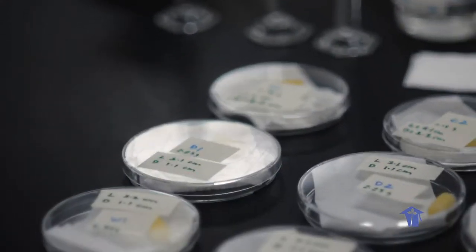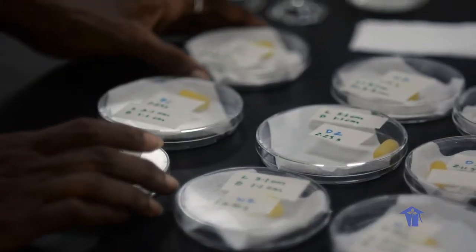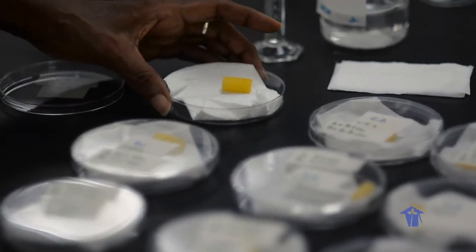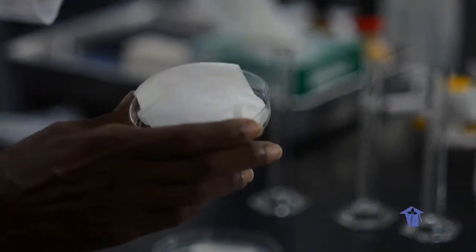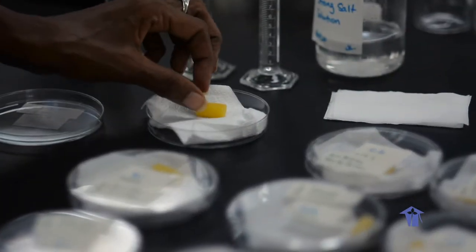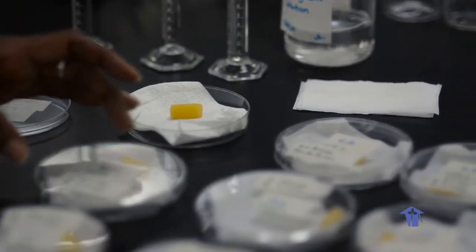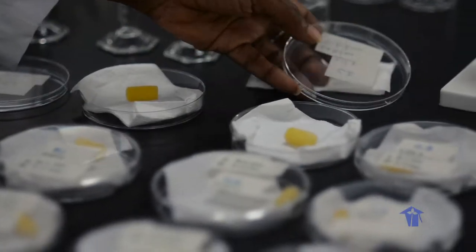In order to make these potato strips, we have used a cork borer and obtained approximately 2 cm in length of each one of our potato strips, and then we just dried them out and kept them fairly dry by placing them on tissue paper inside of each of the petri dishes.